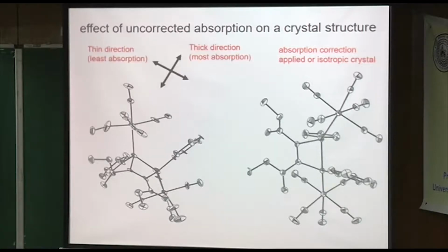Okay. This is also kind of showing the direction. If your absorption is really high, the thermal parameter looks too small, sort of the opposite of what you might think.